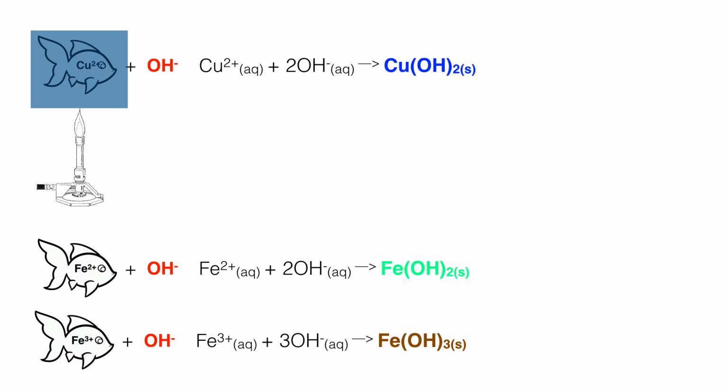test as described before, and copper ions go a blue-green in solution. We talk about barium as having an apple green colour, and the copper ions would go blue-green. So you could, just as a follow-up test, take a small sample of the solution that you had got a positive for copper hydroxide with, take some of that filtrate, expose it to a flame test, spray it in a fine mist, and if you've got a blue-green colour, that's further confirmation for the presence of copper ions. You do need to know that colour. Iron 2 and iron 3 don't have a colour for a flame test that we need to know.